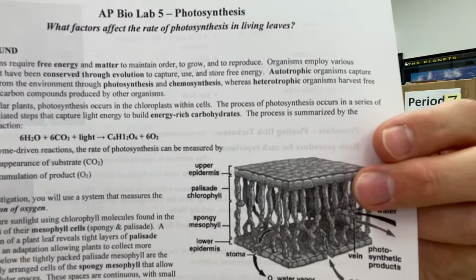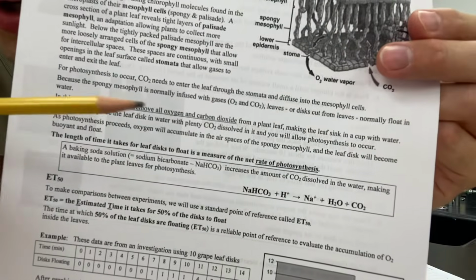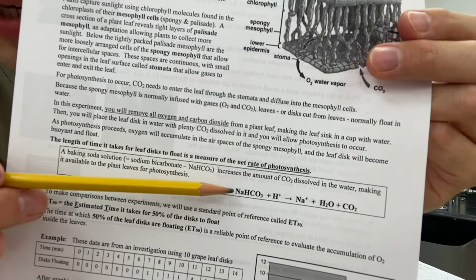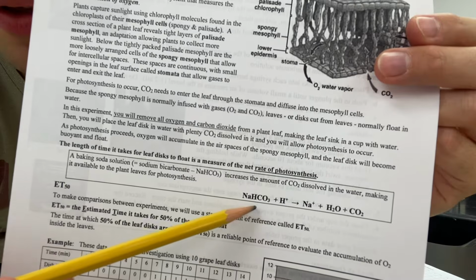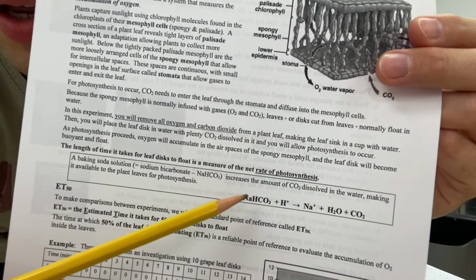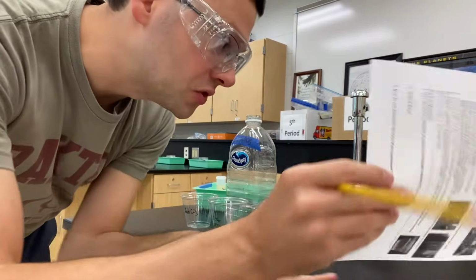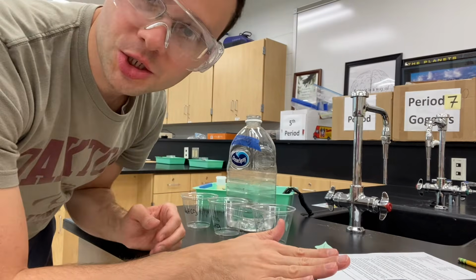If you start by reading the background, you need to understand this major equation for the lab because it explains why the leaf discs that we are going to use will float. One of your substrates, the main substrate we're going to add to this experiment, is sodium bicarbonate. Sodium bicarbonate provides the solution with free carbon dioxide that the leaf discs will then use as they do photosynthesis.